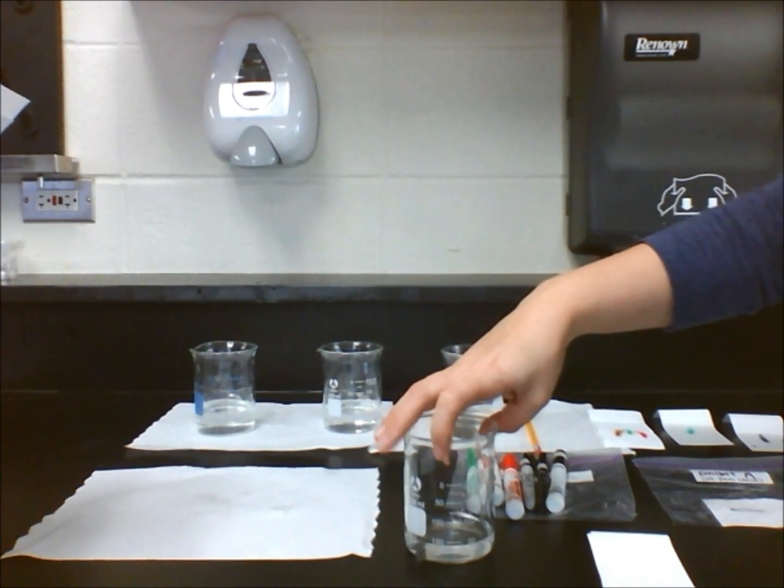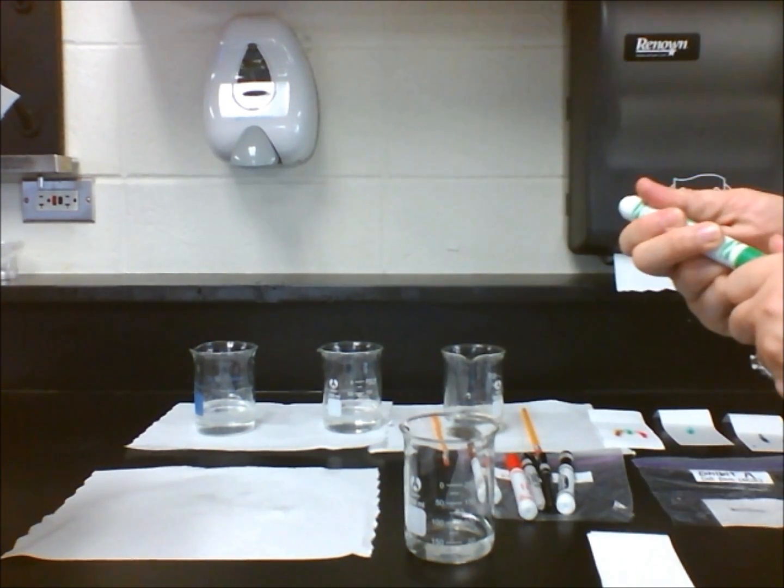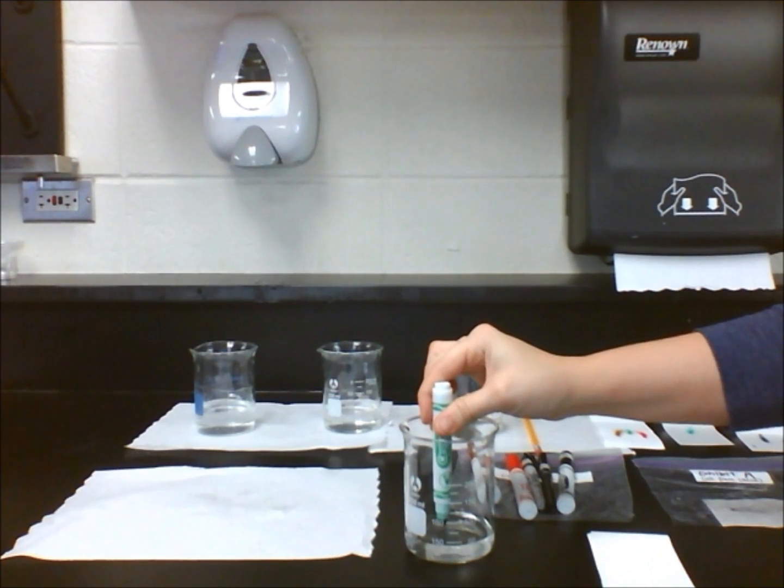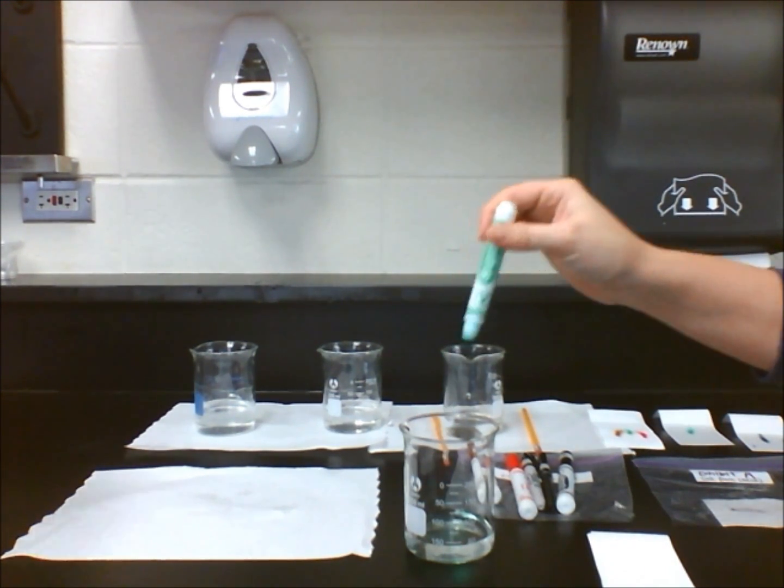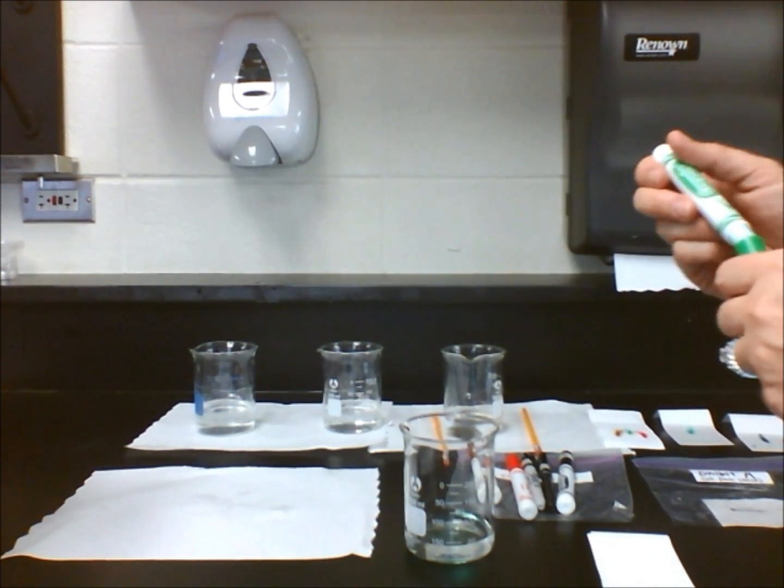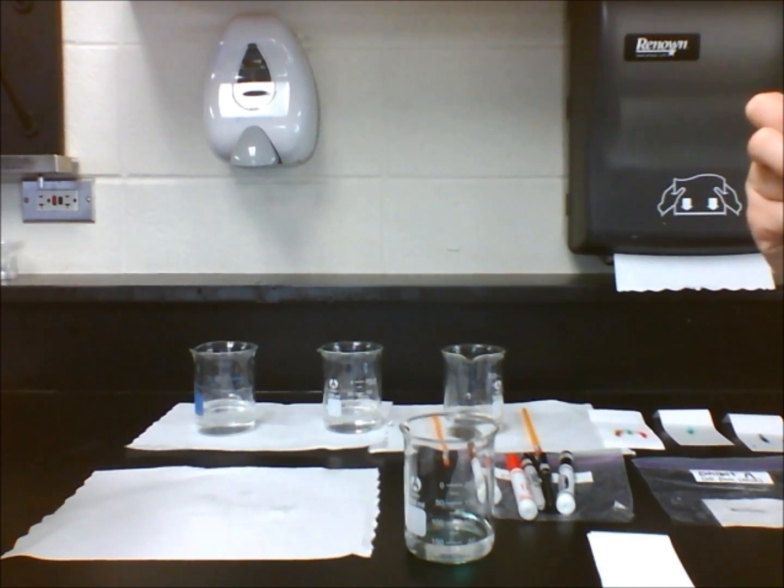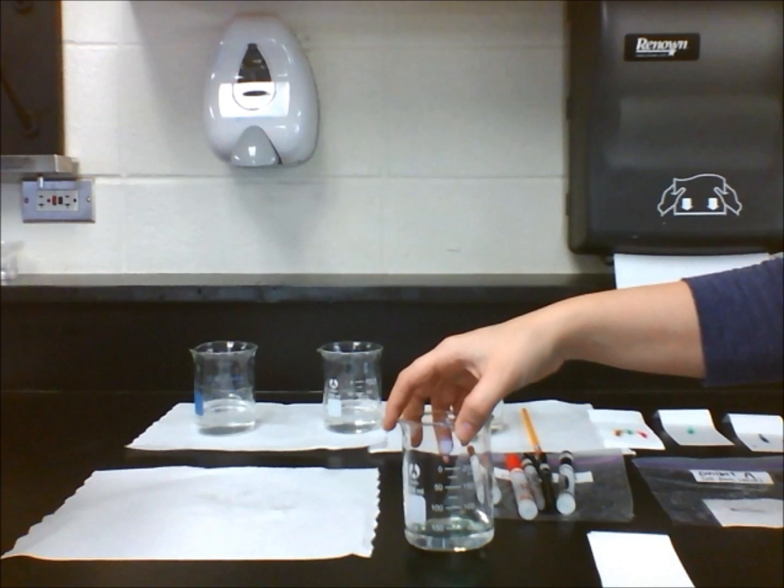Let's fill a beaker with 25 milliliters of water. If we dip the tip of a green marker in the water for just a second, what happens? You will see that the ink dissolves in the water and that it eventually turns light green. We can conclude that the green ink is soluble.